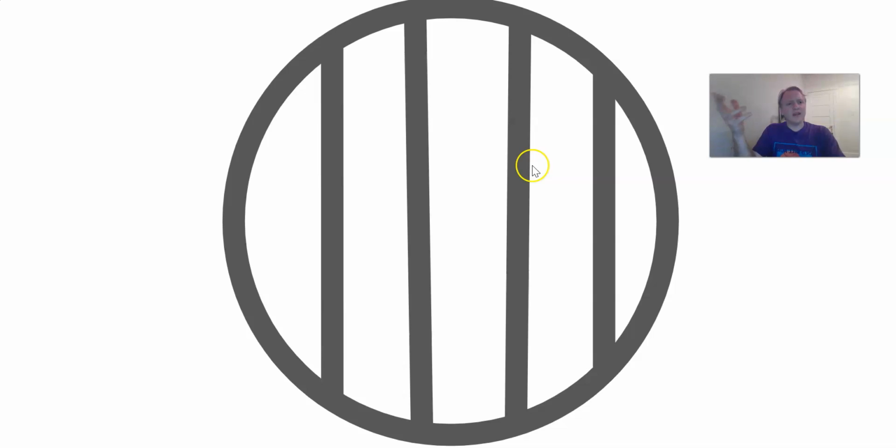Put it right onto the stage so that when you look at it, it looks something like this. Okay, I want you to focus in on the metric side of the ruler. And when you do focus it, you should see something that resembles this. Each of these lines represents 1 millimeter. And so if I was looking at this, I would say what I'm able to see in my field of view is about 1, 2, 3, 4. I would call that 5 millimeters. So in this case, my field of view is 5 millimeters or 5,000 micrometers.